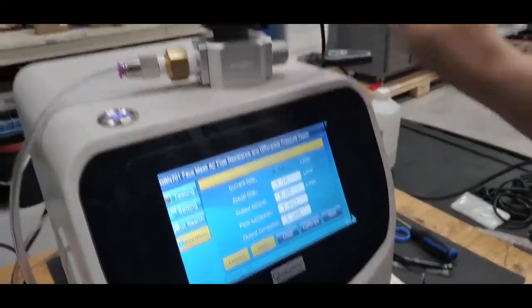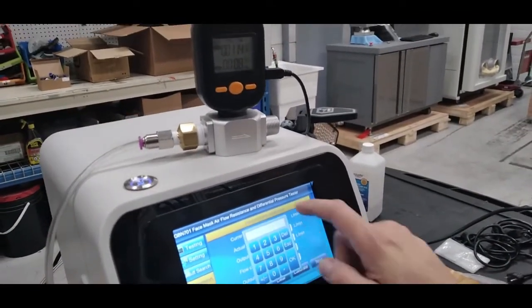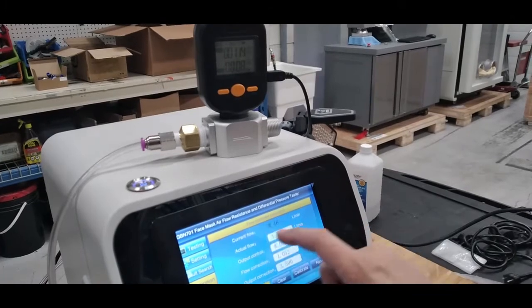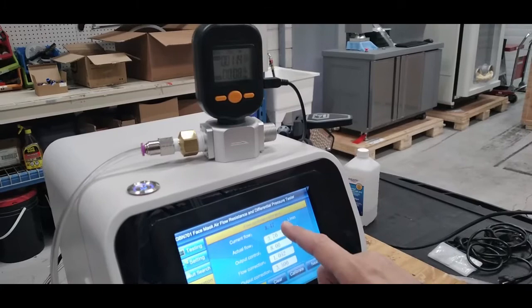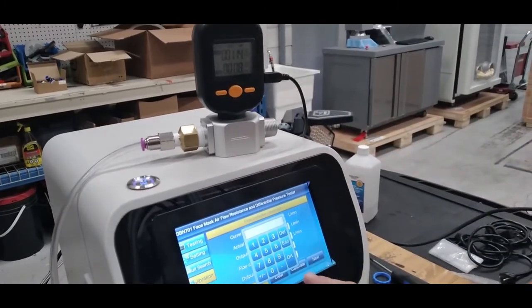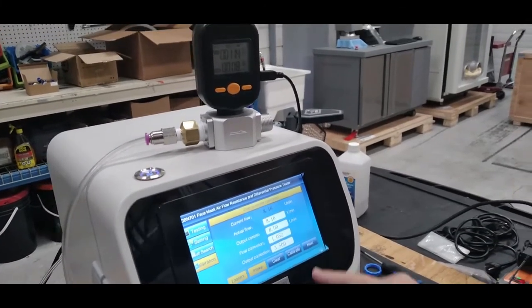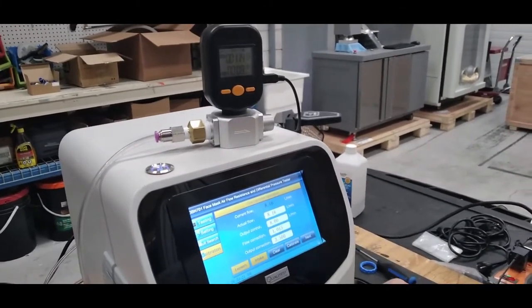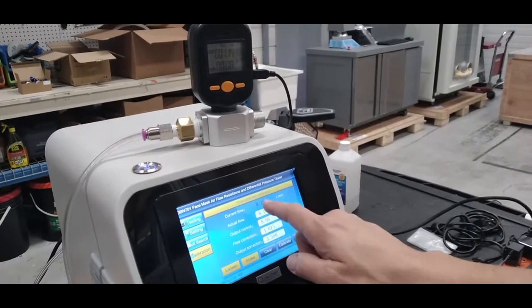Once your gauge and your actual current flow match, press calibrate. Right now it's reading 8.16. Once you press calibrate, it will apply the flow correction and read the proper value.